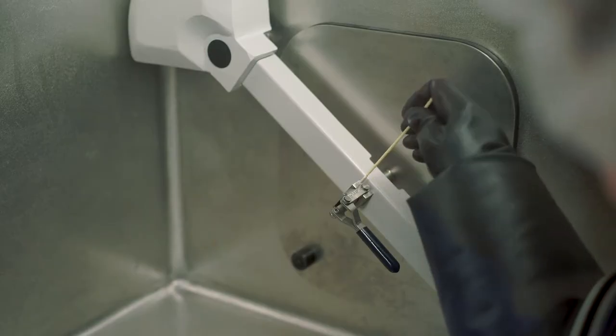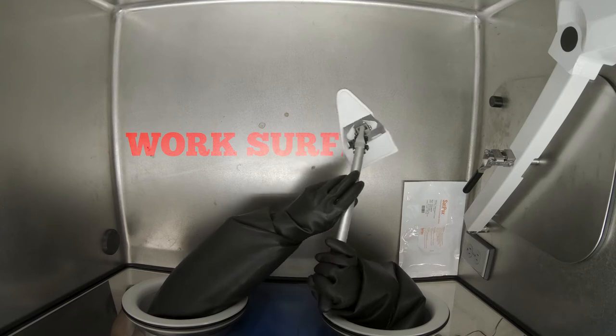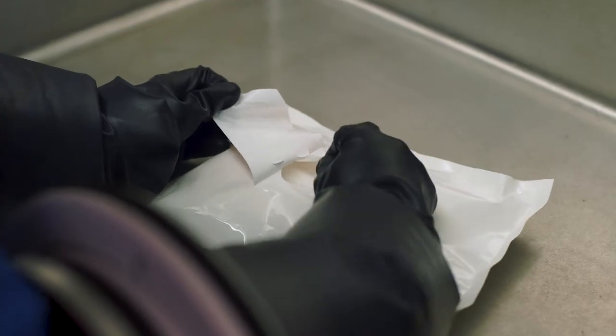Swab the corners. Clean the work surface. You can also use a sterile pre-saturated wipe to clean the work surface.